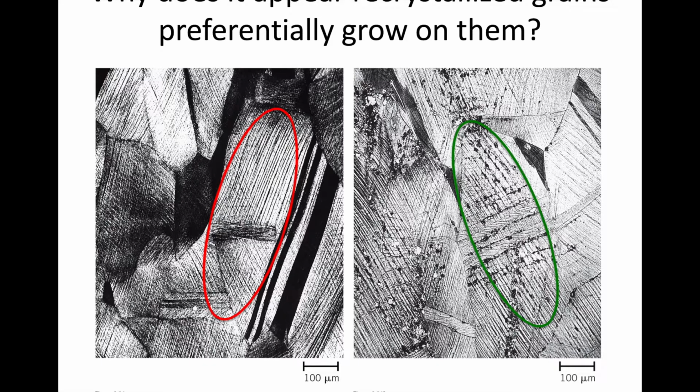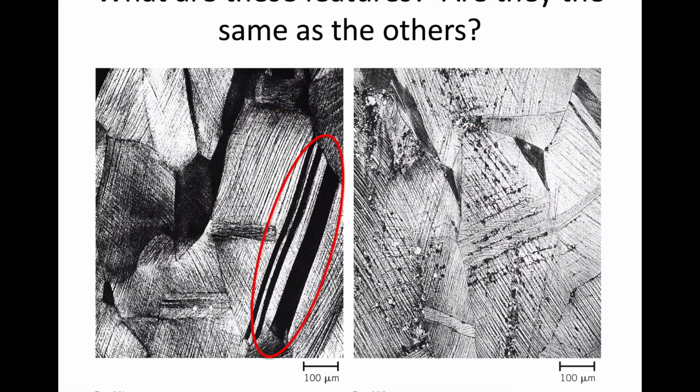All right, so that's what you should be asking yourself: what are these? We see these in our microstructures from the images I've already put up on the course Google Drive. You can see that we also have versions of these lines in the grains that are not scratches. There are some scratches in the images, but this is not the same. Also, we still see these features too, and you can see a distinct difference in the width of these features, right? So you should also think about what those features are. So take a minute and think about that, but in the next slide, I'm going to show you what these two features are.